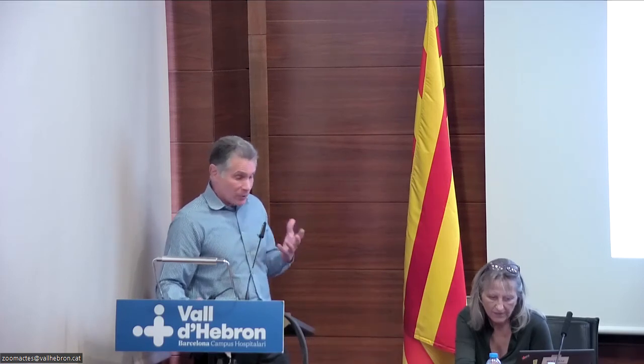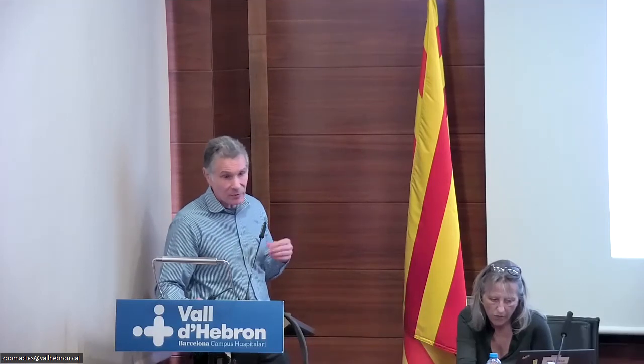So if you're looking at metastases, if you have a primary tumor and then get metastatic lesions forming after the fact, in mouse models you can easily see them, just a few cells, a very small cluster, or even theoretically down to one single cell. So yes, it all comes down to a combination of expression of the luciferase within the cells and the energetics, how much ATP is being produced when you've got a biologically active system, such as using Firefly.